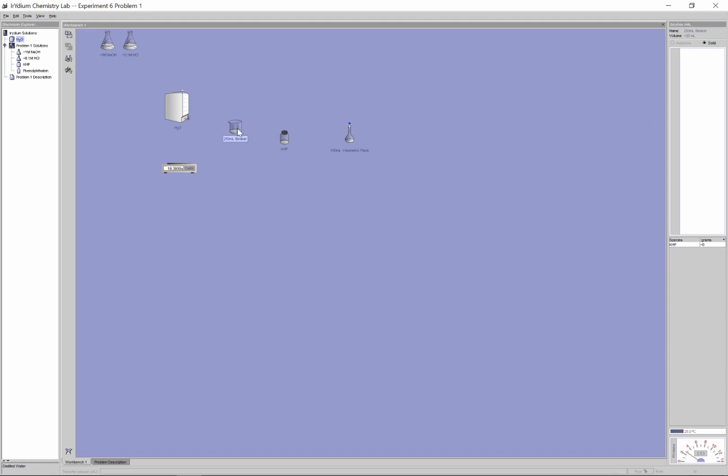There is a little bit left over, maybe leftover solid that hasn't dissolved, maybe leftover liquid. Because I was way under 100, I'm pretty confident I can add some more water here. Let's say I add another 40. Let's make it different here. Maybe I'll dissolve the rest of it. That'll rinse down some of the sides. I can transfer it into my volumetric.